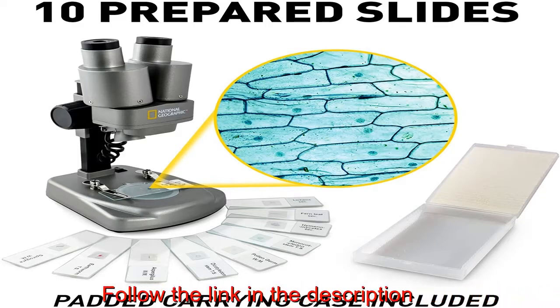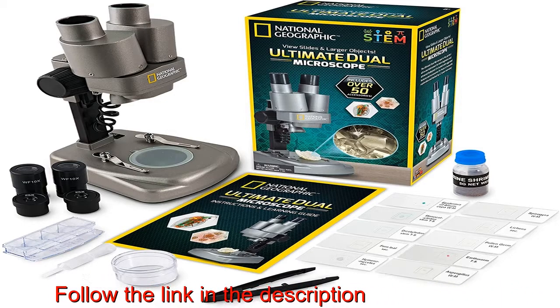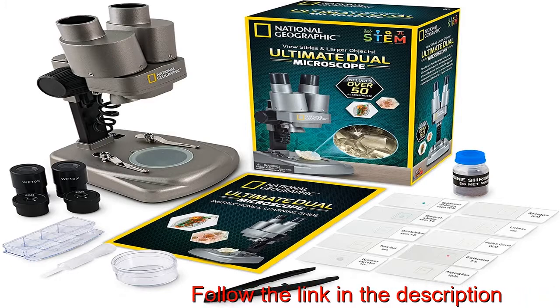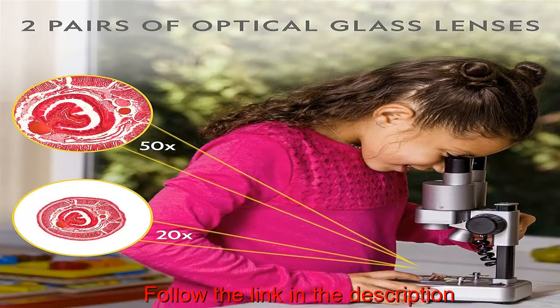The perfect STEM activity for boys and girls. Over 50 accessories included. Explore a curated set of 10 prepared slides with a range of biological specimens, then create your own with the included blank slides and covers, tweezers, and an eyedropper.